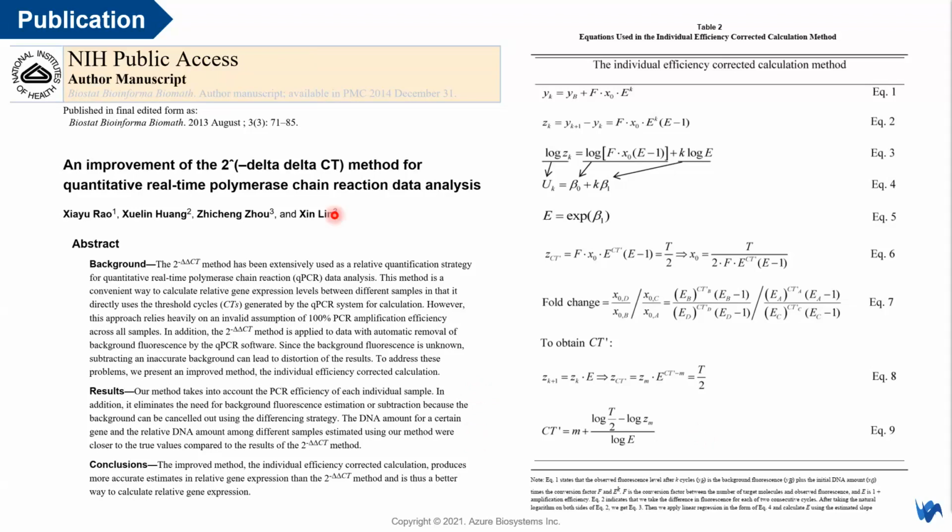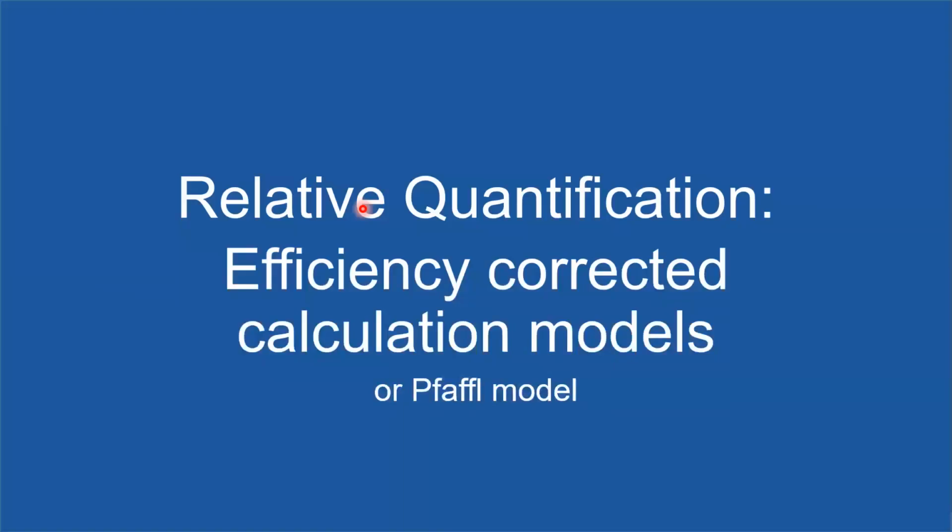Right, let's move to the third quantification strategy, which is the efficiency corrected calculation model, or we call it the PFAFFL model.